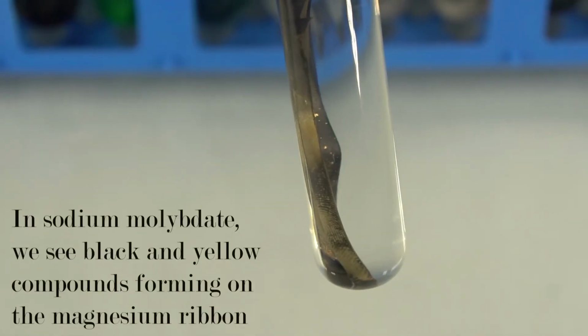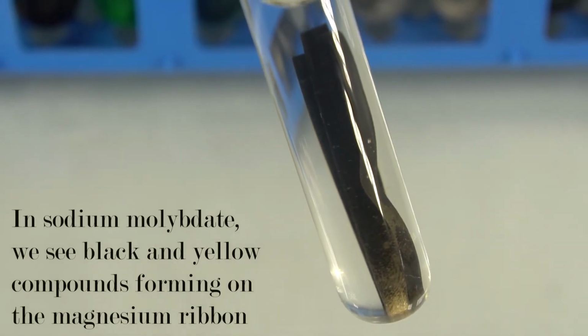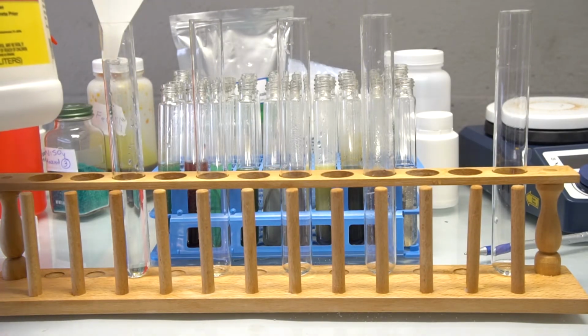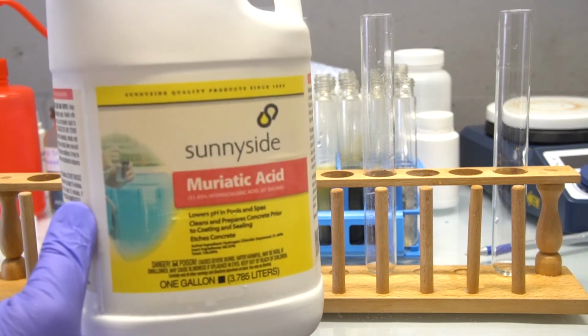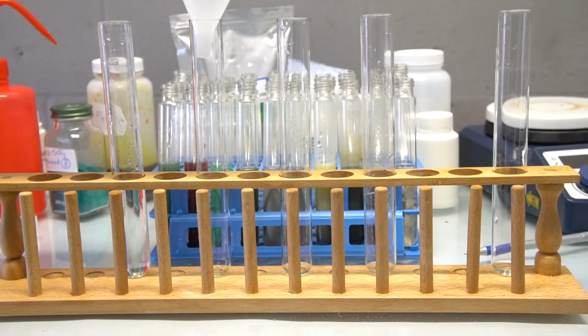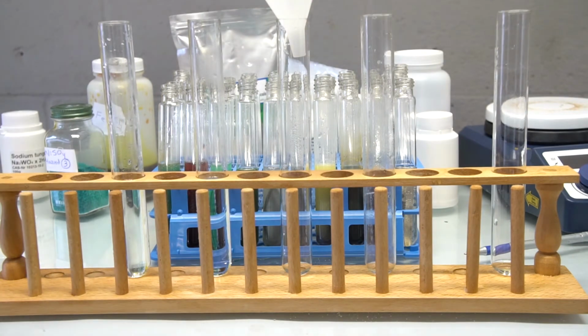So there's definitely 2 different compounds or elements forming on the magnesium strip that we have not been able to identify yet. So let's move on to the acid tests. Like aluminum and many other metals, magnesium has a micro-thin oxide layer called a passivation layer that the acids will have to eat through first.